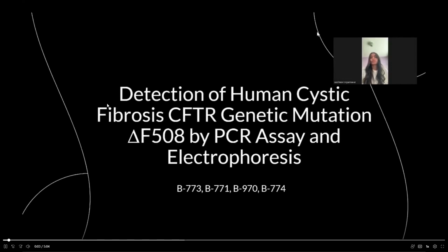This is our presentation on the detection of human cystic fibrosis CFTR genetic mutation delta F508 by PCR assay and gel electrophoresis.